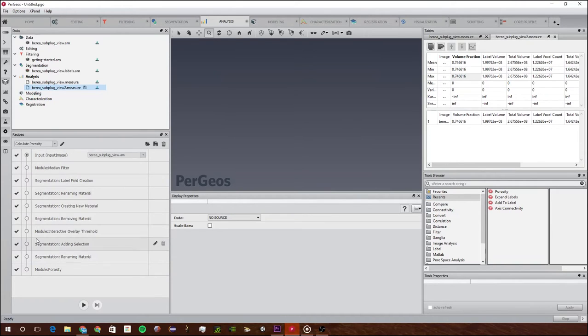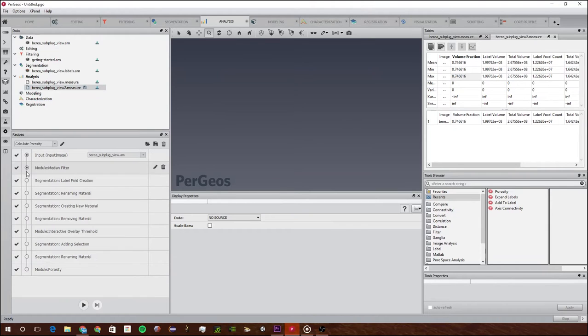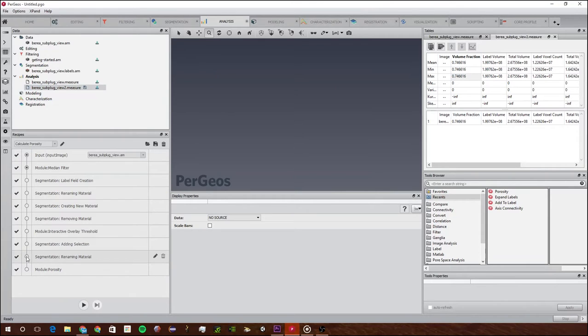Let's say it's a different one and the segmentation is different. To add a breakpoint where you can change it, you can just click on this button. If it has this black dot in the center it will stop there and allow you to change it. It only works with blocks because they are the only ones with settings to change.